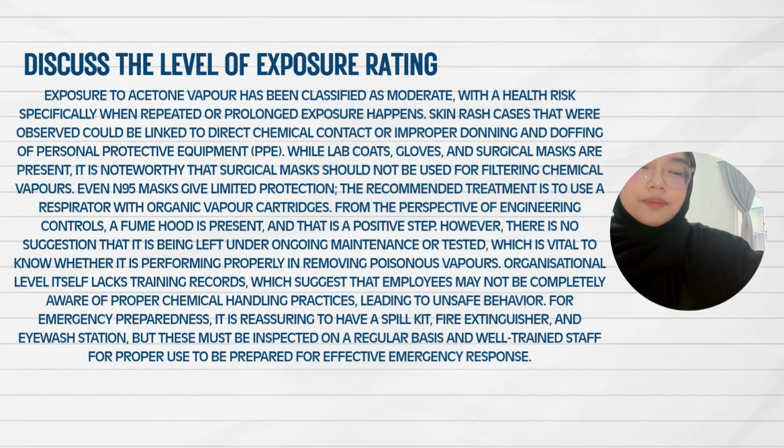Exposure to acetone vapor has been classified as moderate with a health risk, especially when repeated or prolonged exposure happens. Skin rash cases that were observed could be linked to direct chemical contact or improper donning and doffing of personal protective equipment (PPE). While lab coat, gloves and surgical masks are present, it is noteworthy that surgical masks should not be used for filtering chemical vapor.